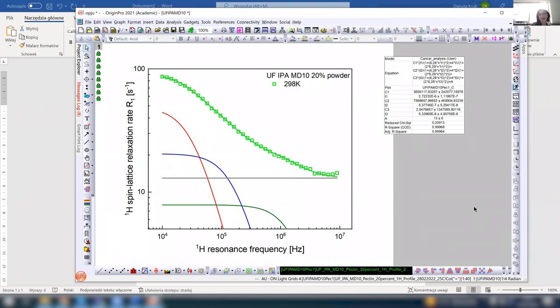Thanks. Very helpful. It was great to see step by step how the fitting works. Maybe it was not very professional, but if we do it together, there are not so many people here. And the video will be available, so people will have the chance to follow the steps later while they watch it afterwards. So okay. I think it's very valuable. Thank you so much. Thanks.